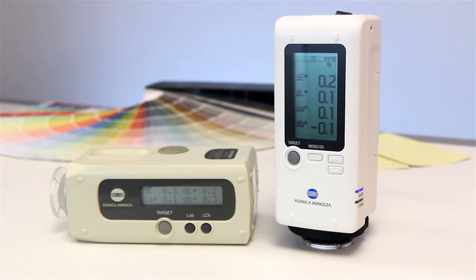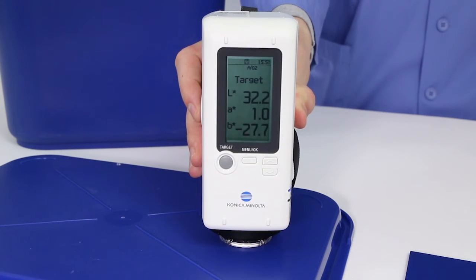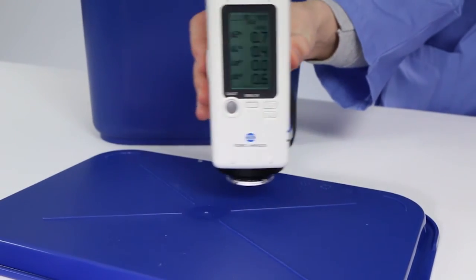The new CR10 Plus features a bigger display with a more durable and lightweight design. This new design combined with a built-in xenon lamp light source ensures accuracy, repeatability and ease in a variety of measuring conditions.